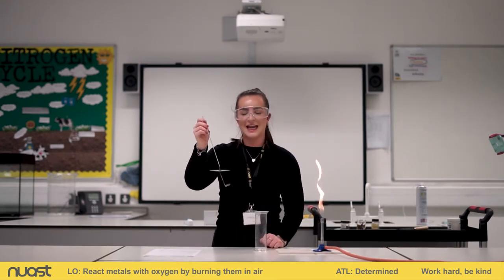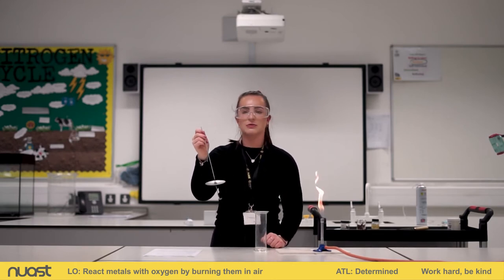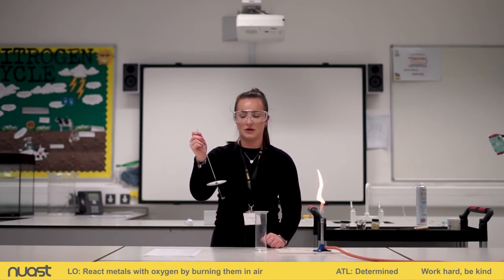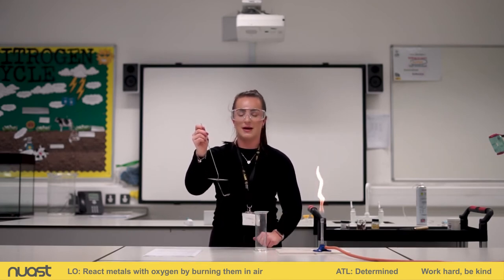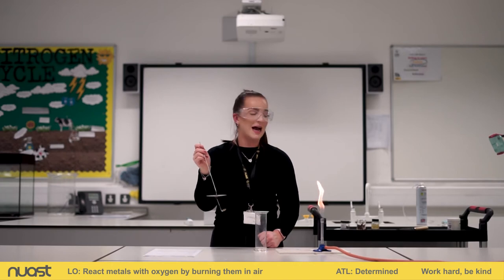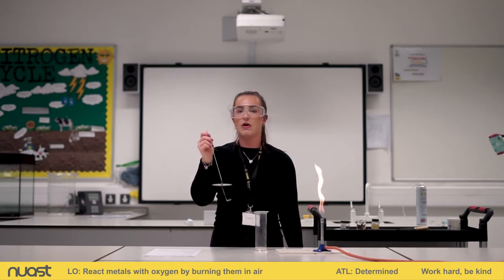So unfortunately, it looks like our calcium's not going to react, okay? And that's not because calcium doesn't react with oxygen, because it does react with oxygen. It reacts with oxygen very easily, okay? The easiest out of our four metals. And because of that, I think my sample of calcium that I've actually got has already oxidized.